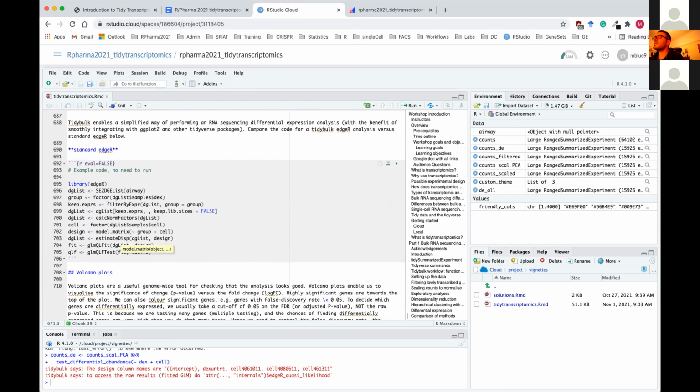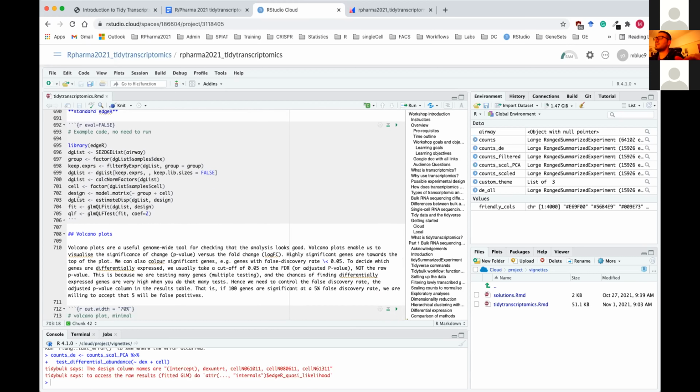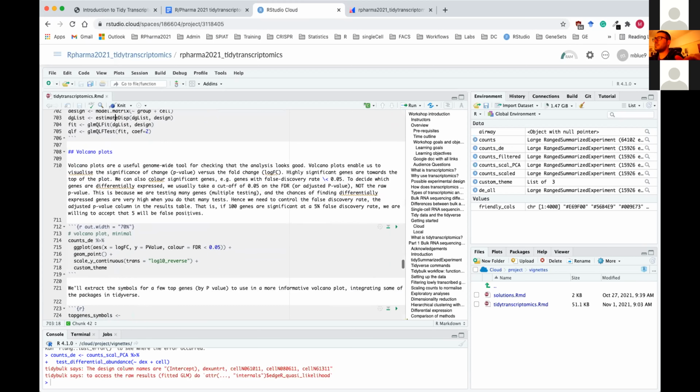Okay, and again, for comparison with a base R non-Tidyverse method, this would be how you could do that similar style analysis. But again, just note the functions have more difficult to understand names, like less easy vocabulary. And also, again, you have to create a lot more variables, whereas the Tidyverse pipe enables you to use fewer variables, and so hopefully have less bug-prone and quicker to type code.